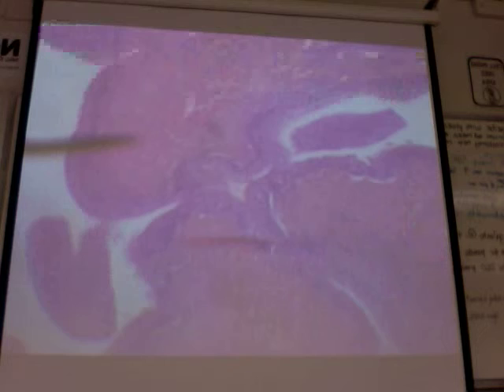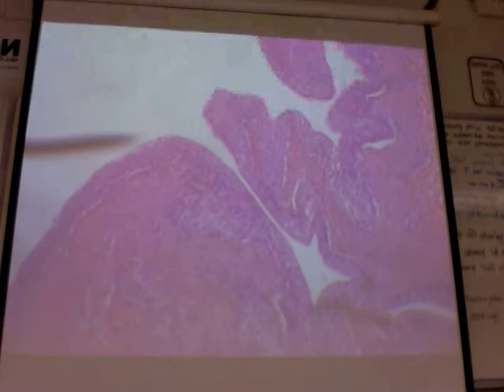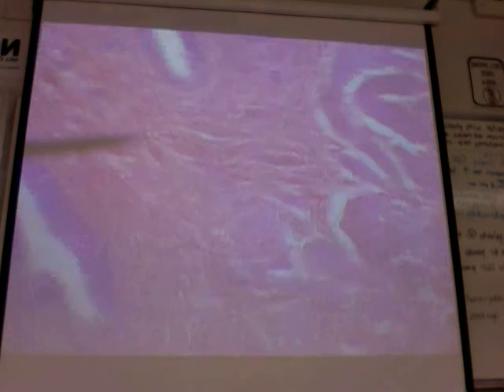We'll also see the detrusor muscle. But let's look. Okay, come on. All righty. So right along in here, this stuff here. I don't know what this little thing right there is. It looks like just something that broke off. I don't know what the heck it is. But anyway, the epithelial lining here will be the same as the epithelial lining of the ureter. It's transitional. The actual muscular wall of the, I'm a little ahead of myself.